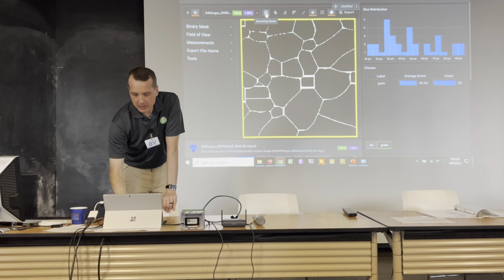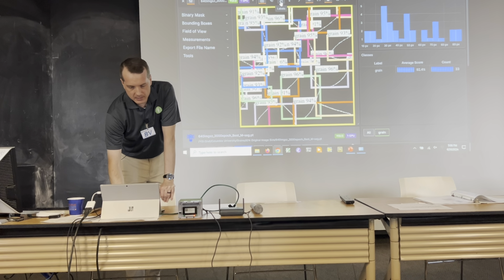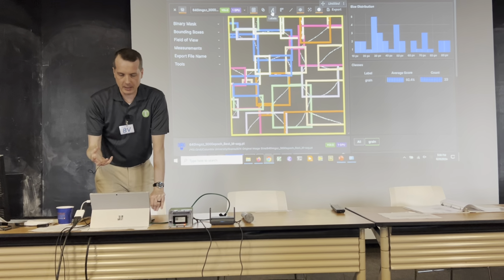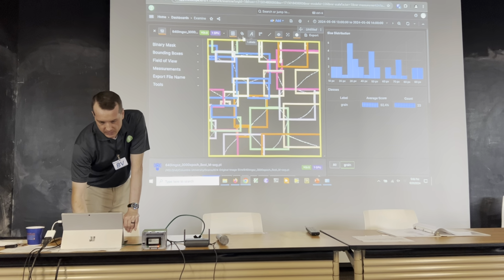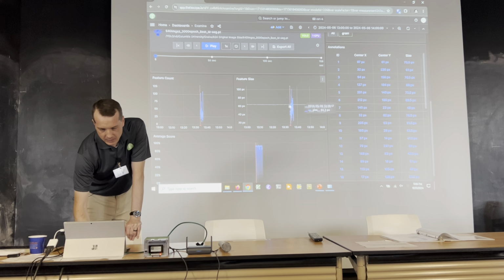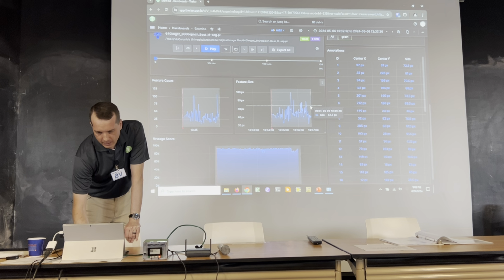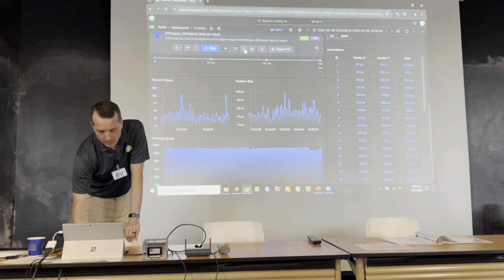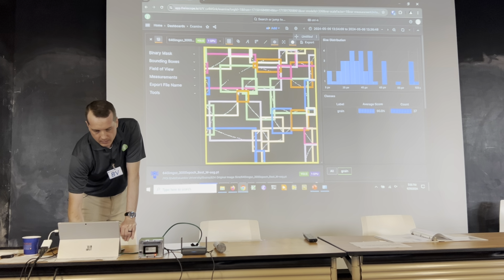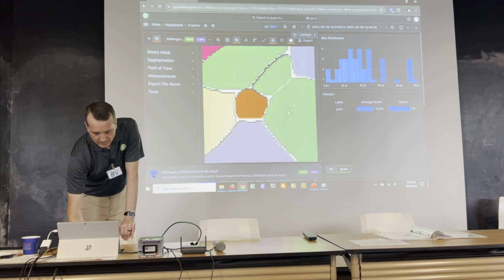This was a pretty good demonstration of the various ways we could also do just the bounding boxes if you wanted, and so on. I don't want to do a whole demonstration of everything that's going on in here, but I wanted to show that particular one because you're also getting your size distribution, you're getting your annotations, and we can zoom in on the timeline. For those of you old enough, this is like a VCR. We can move forward and backwards in time and see all the different images as they're moving. We can also zoom in and look at particular items in our system.